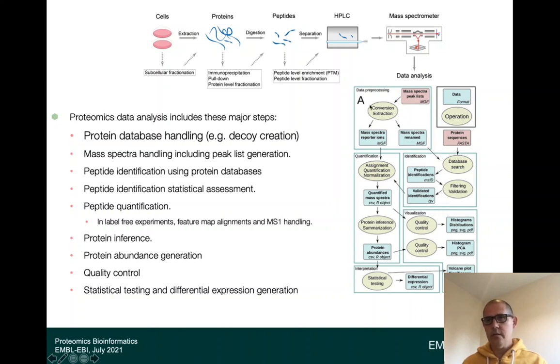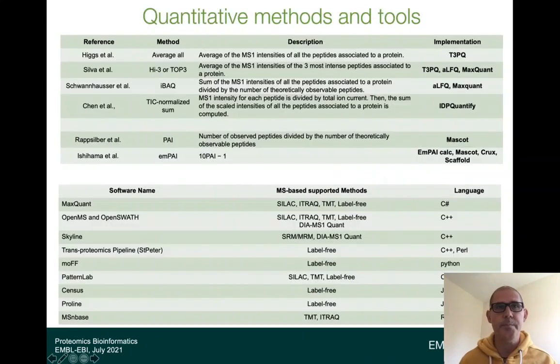As you can see, there are multiple steps here. All of them can be divided into even more tiny steps that are complex in their own right, and they consume time and also compute power in terms of CPU, memory, and so on. Today we will talk about tools that do all of these steps, and I will particularly talk about how you can distribute all this processing in a more distributed way.